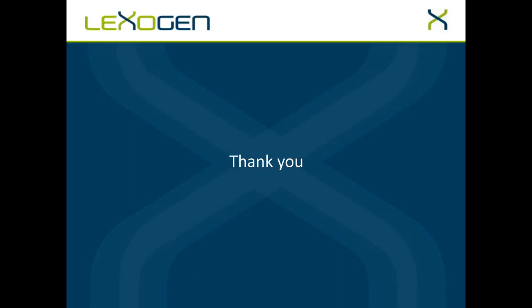Is the evaluator available as an open source command line package? Not yet, let's put it this way. We've realized it in a Galaxy environment, but I would have to talk to our bioinformaticians about how we could do that. If you drop me an email, I can put you in touch and we can arrange for that. Is this an open source design? Definitely, yes. The whole software and the whole algorithms behind this SIRV suite are completely open.